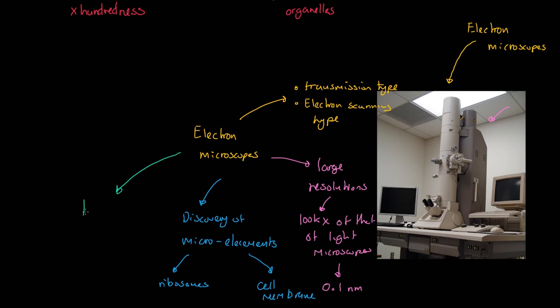Now, one of the things you might find interesting is that electron microscopy happens inside a vacuum. So first of all, if we just consider this to be a big tube, inside that tube is a vacuum. It's important we realize that, because the conditions required make this very expensive, very exclusive, but also in some conditions quite hard to control.